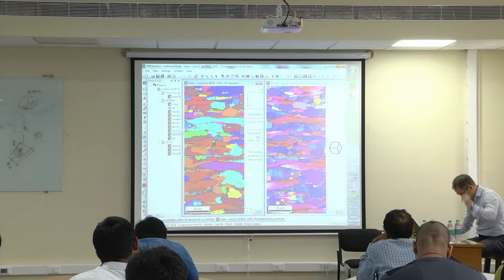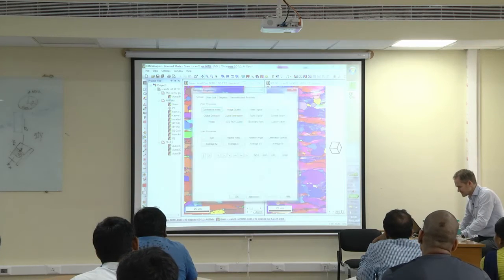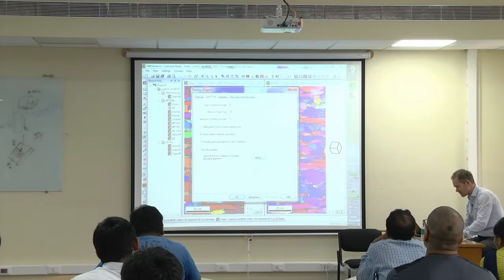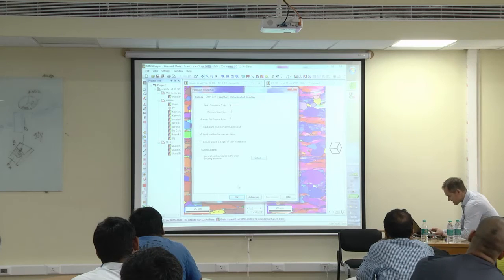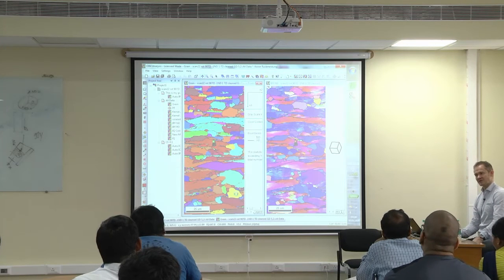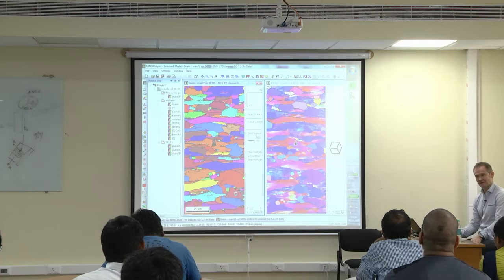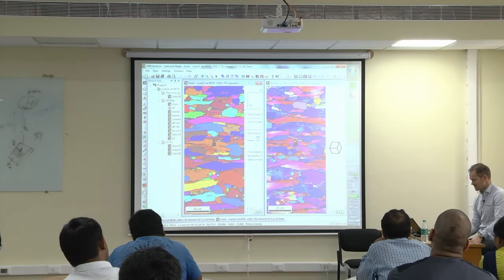Nah, I go to 5 degree. The default seems to be, at least for a quick shot now, the default seems to be the best setting. But then it doesn't separate there. It can't be helped. It's impossible to do it perfectly satisfyingly. But you see how tricky that is. You can modify your grain size by selecting what you mean by a grain. And it is up to you really to make a proper selection there.